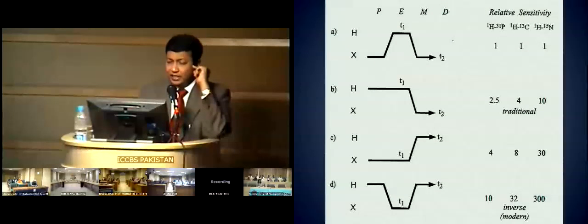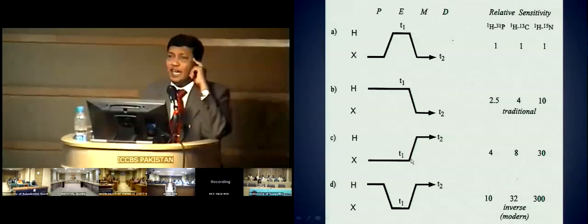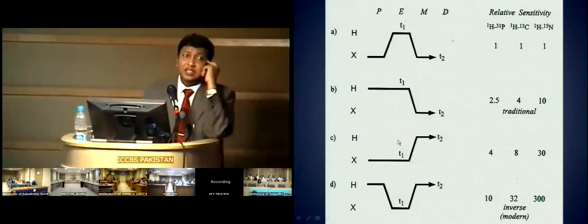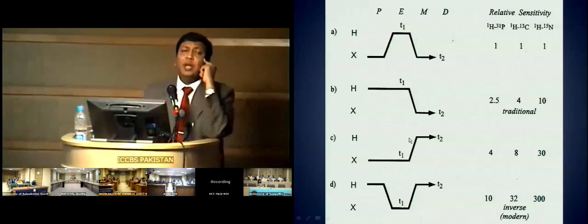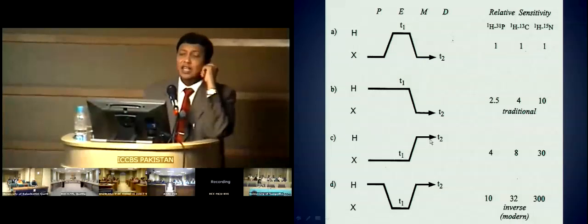And then you give a 90 pulse that goes to the Z and negative Z. H is not at this stage yet. H is still on Z. Remember, so you mix the population of carbon to the proton, and then you bring your proton to the XY plane, and then you detect it, as you have done in case of this.